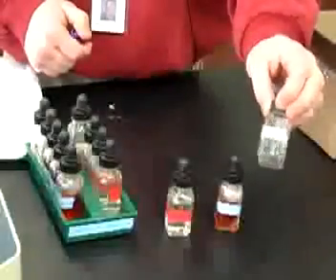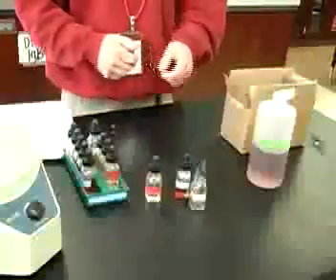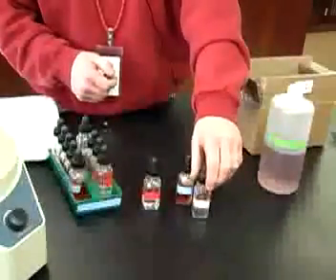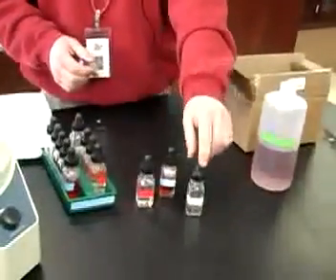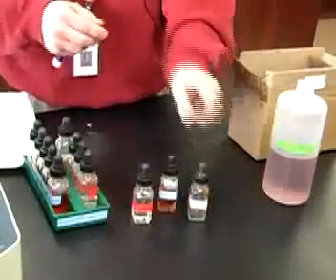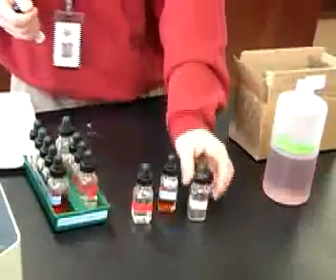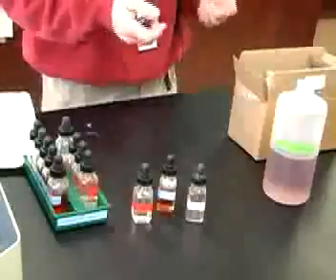But this, for instance, would be the 6 molar H2SO4. 6 molar is fairly concentrated sulfuric acid. It's not something that you want to leave the cap ajar on and leave sitting like this at your lab station. So safety and care is really, really important in this lab. When you pick up a bottle, never pick the bottle up by the cap, because just in case somebody left the cap loose, maybe you'll pick it up and boom, over it spills, and now all the solution tips onto the table. Always make sure to pick up the bottle by the bottle, not by the cap, just in case somebody forgot to put the top on tight.